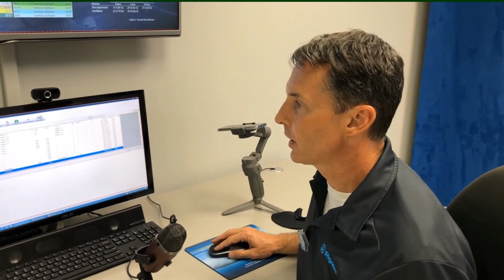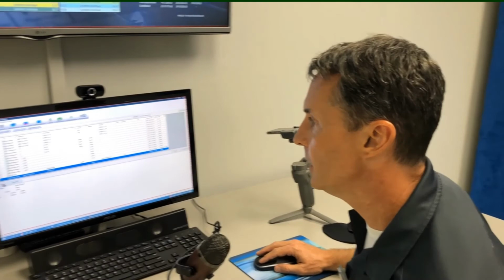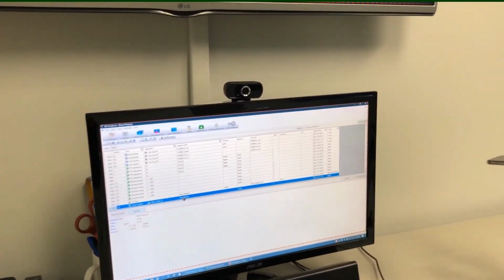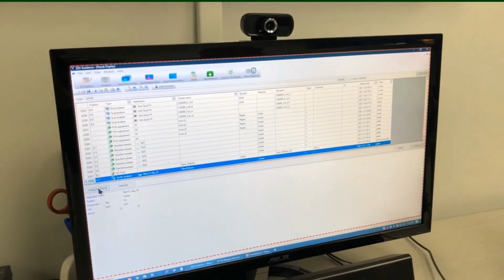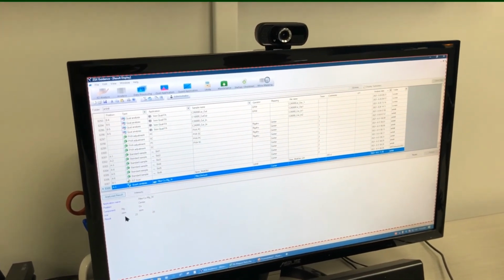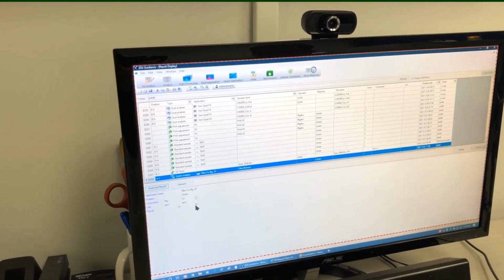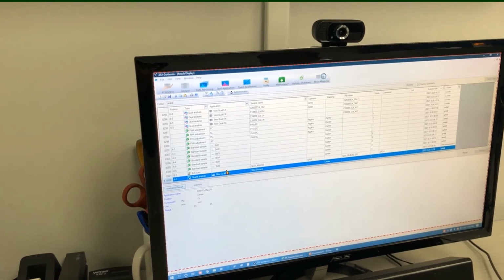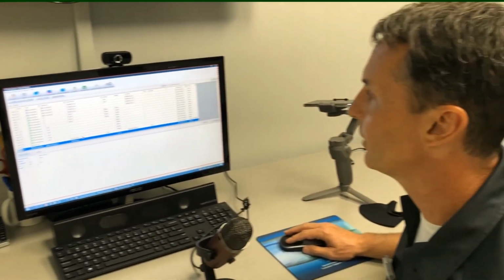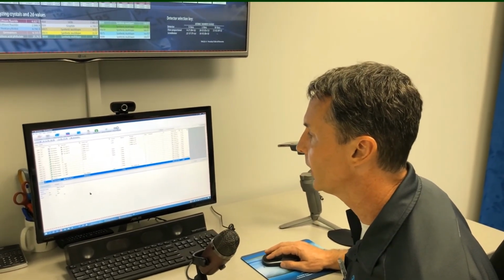Okay, so you can see that our analyses are complete. We have the analyzed results for both the Quant method, the 25 ppm check. It shows our intensities. If we click here, we'll see our results. We're getting 23 ppm for magnesium and 25 ppm for cobalt. So pretty good. And for a method that's just a minute or so long, it's much easier than running it in a sample cell. It's really kind of the way to go.